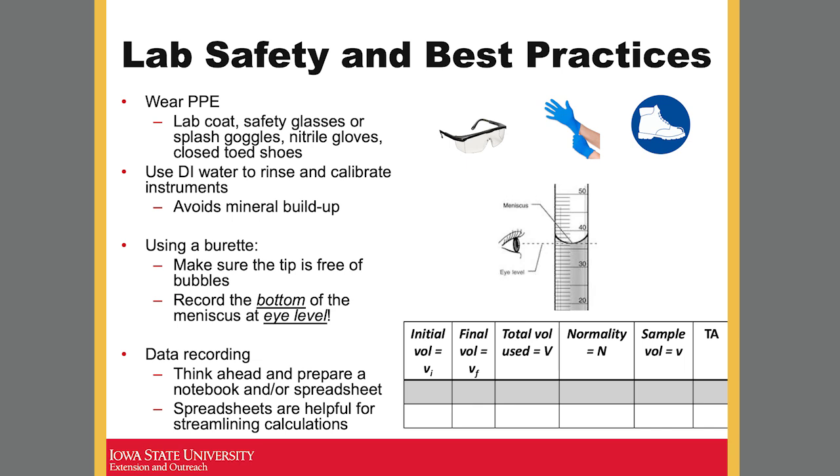And so what we're gonna do today is measure titratable acidity in the grape juice we provided you. You will be asked to record all the different values.